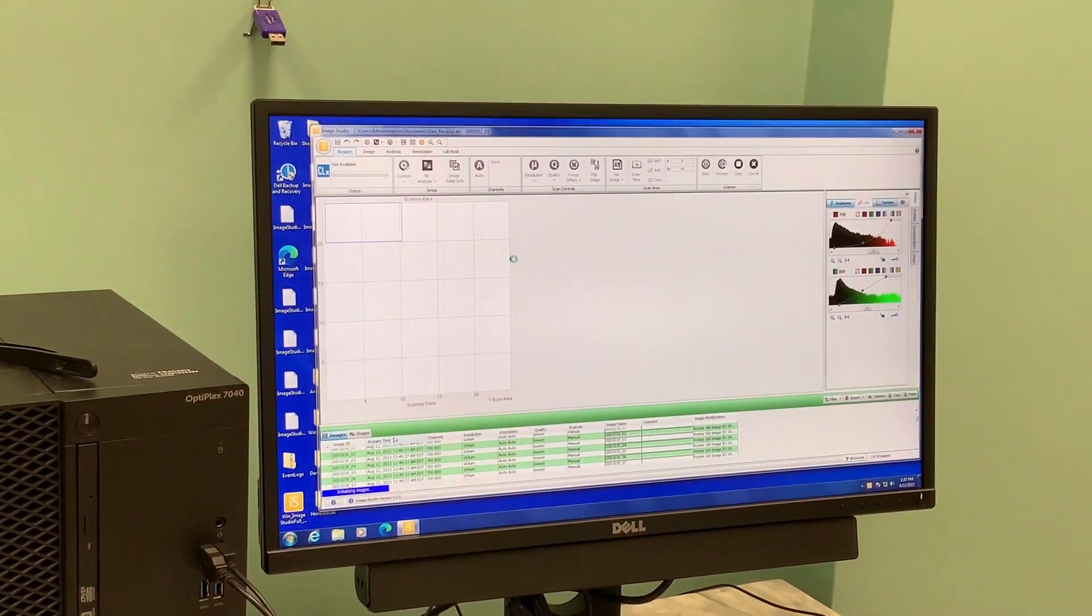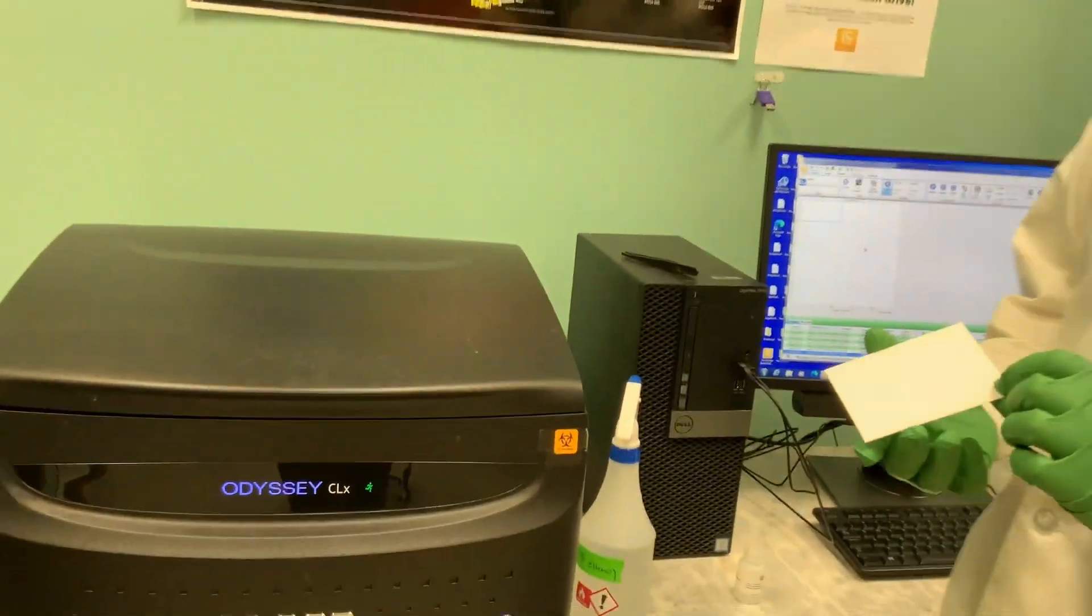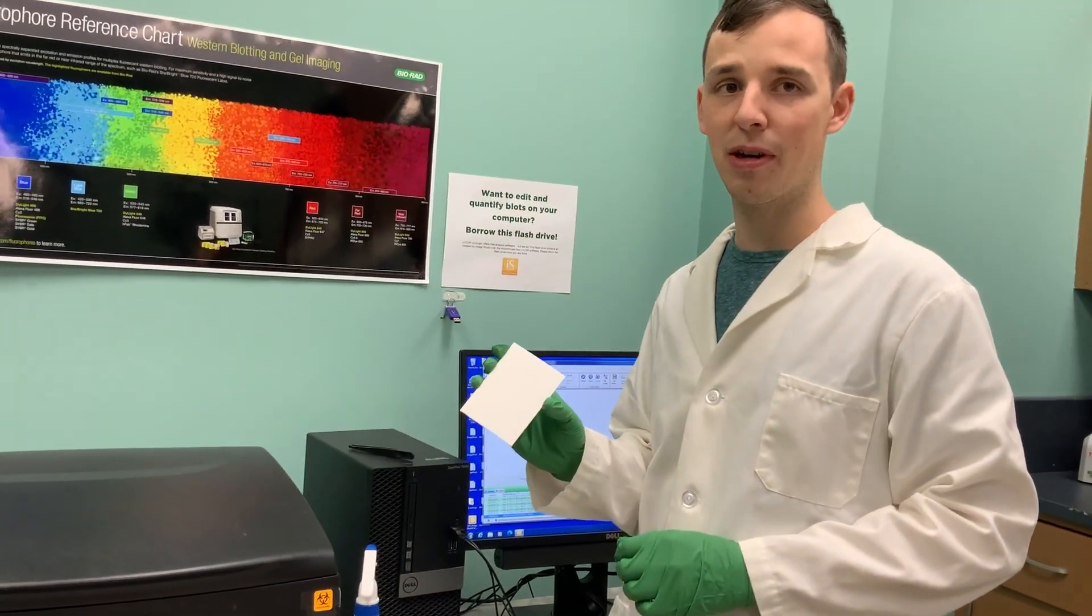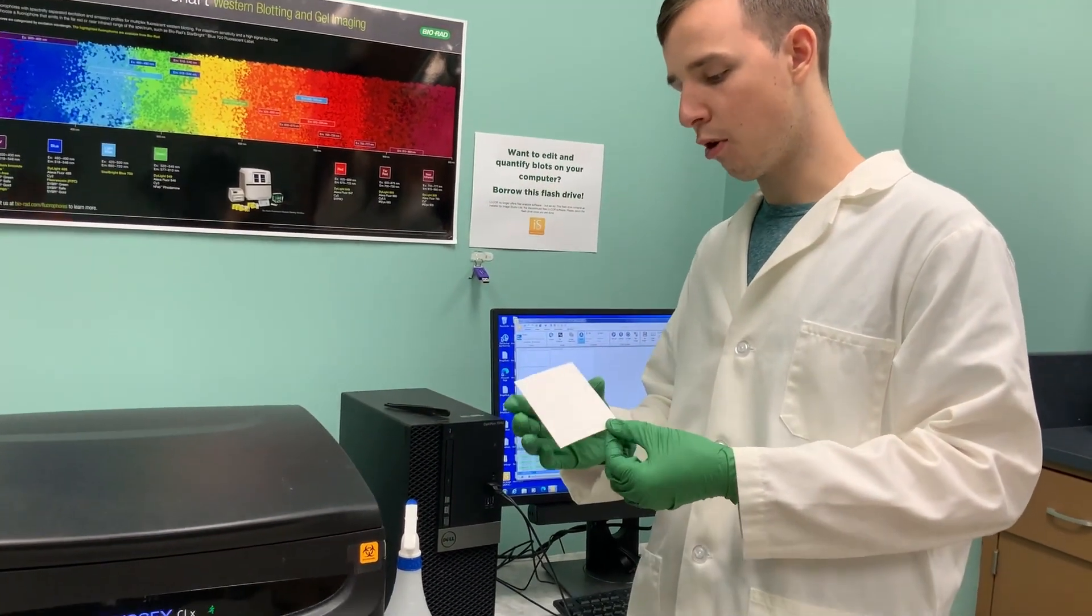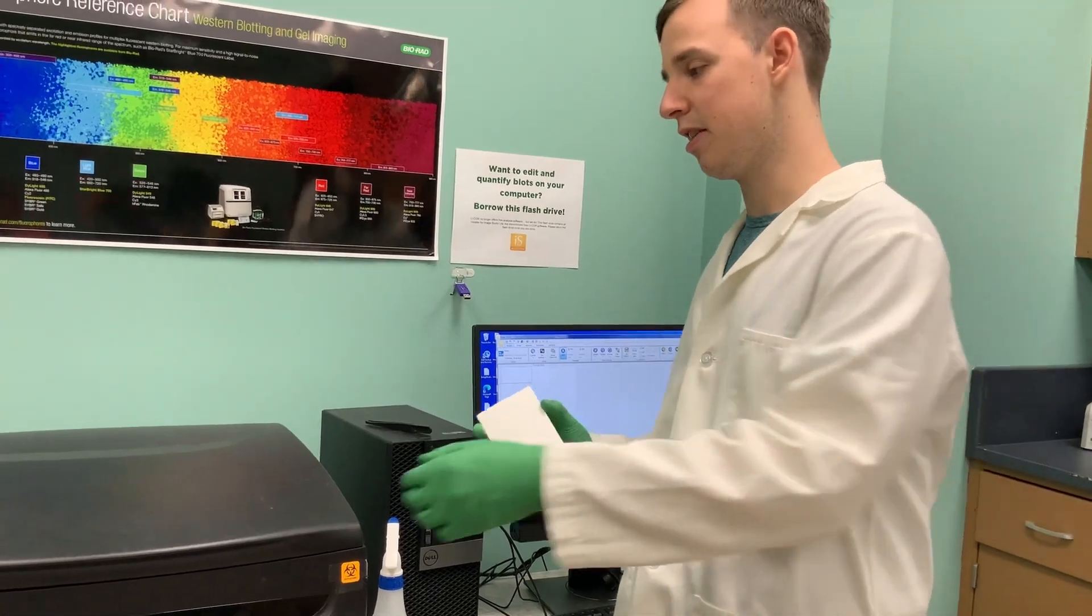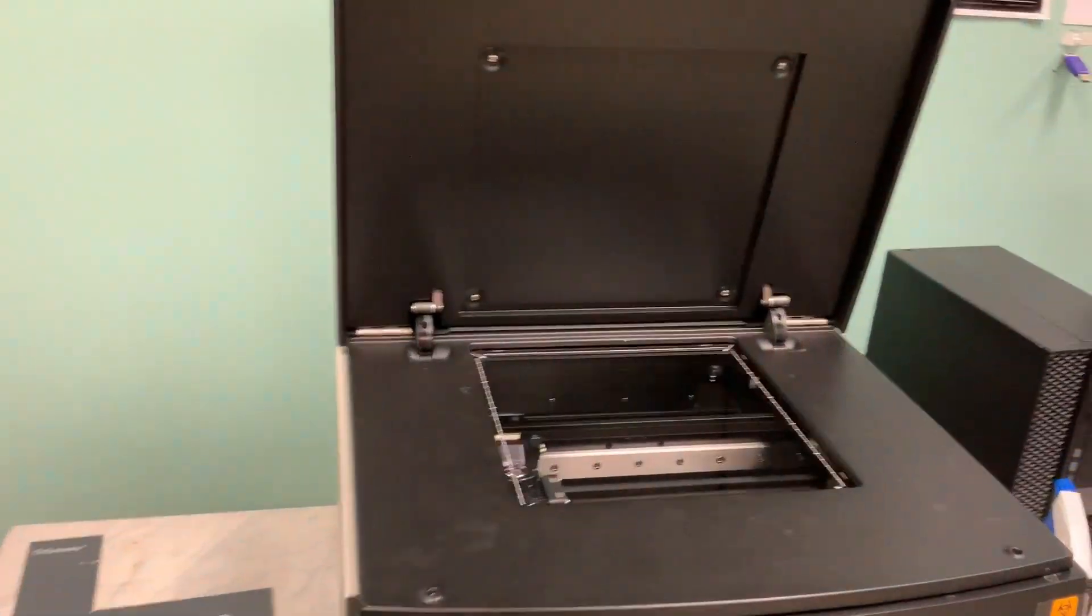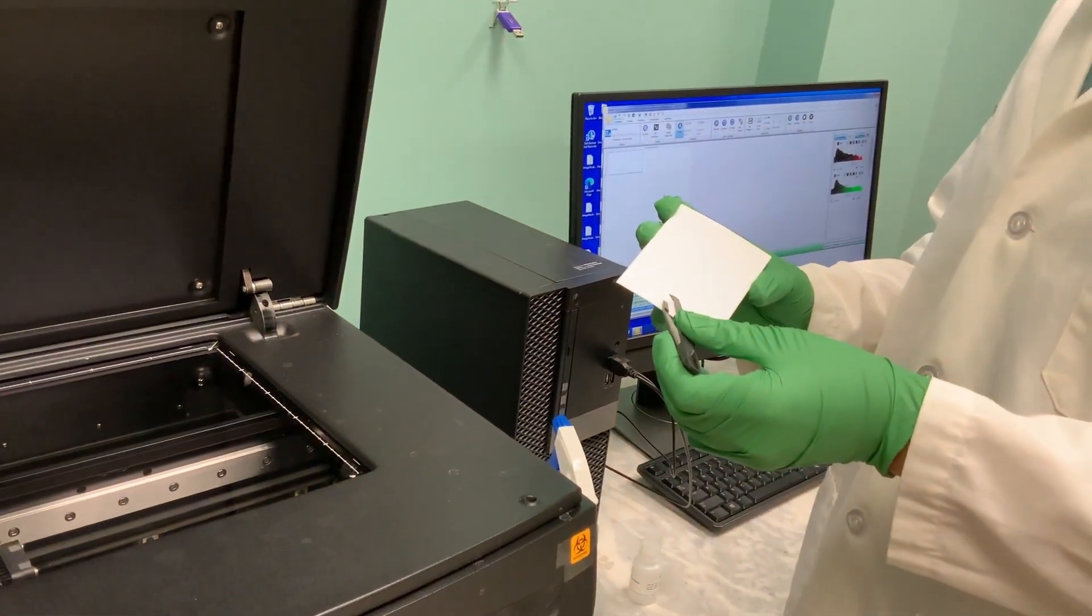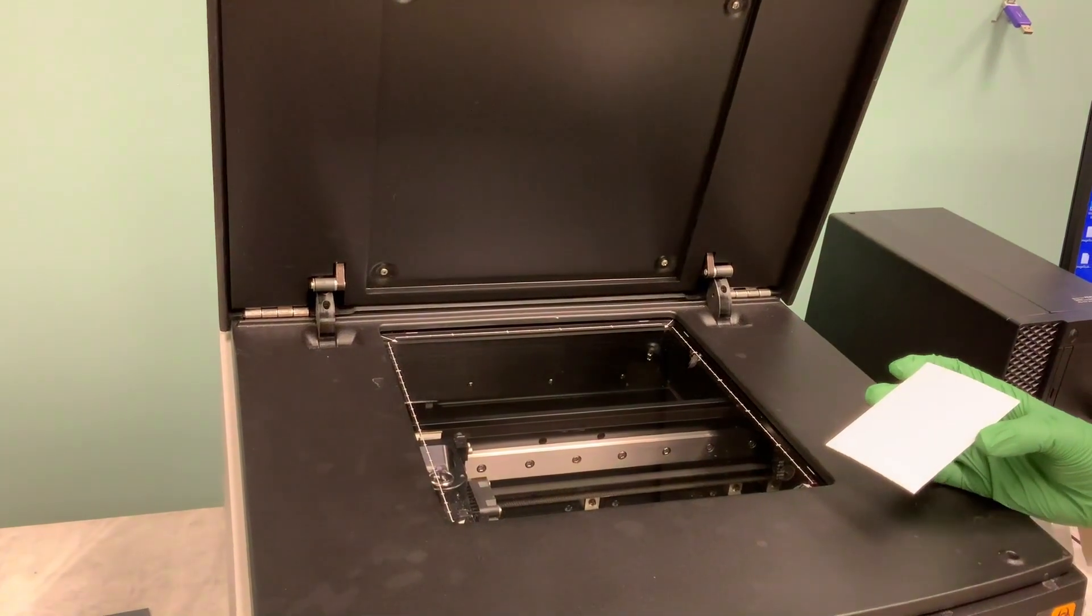It opens up this screen and then we can take our membrane and put it into the machine. Here I'm just going to use a piece of blotting paper because I don't have a membrane ready to image. We open the machine and then we have tweezers either here or there should be some lying around.